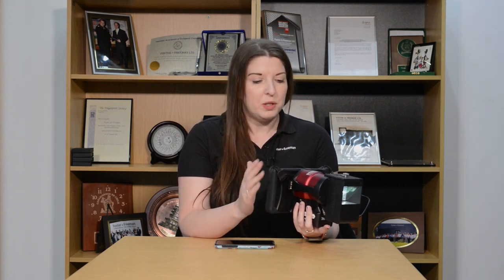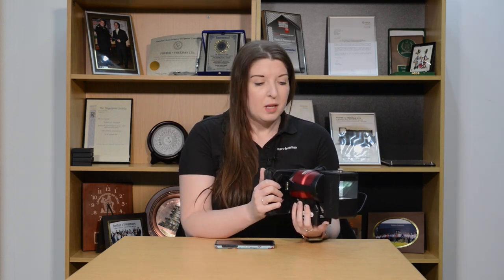Now we've had a look at how you can recover a finger mark using the Crimelight Auto at a scene. The Crimelight Auto is not designed to replace the DCS — it's designed to complement the DCS system, so that you can take images at the crime scene without the need to remove evidence back to the laboratory. Because of the Wi-Fi capabilities of the Crimelight Auto, you can actually send images back via our Crimelight app to the DCS system as well for further enhancement and analysis.